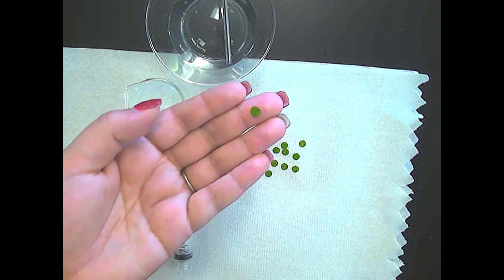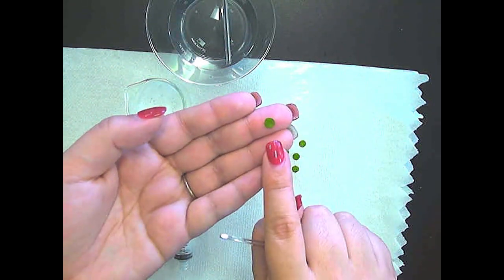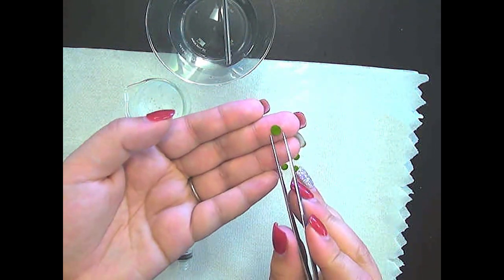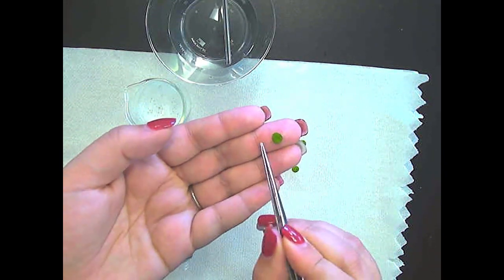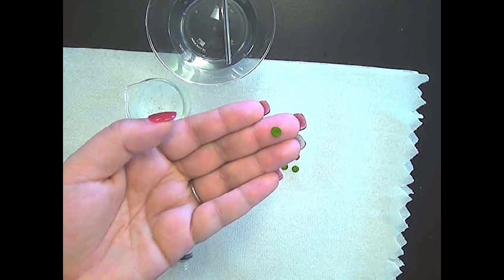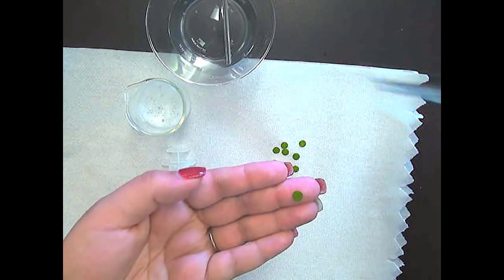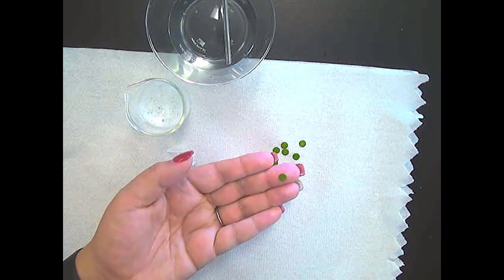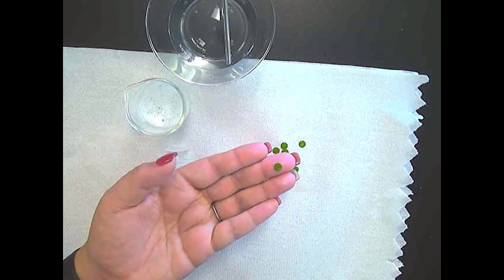Now the chads themselves are just cut from living pothos ivy. Each chad is 0.5 centimeters across in diameter, and the light source we're going to be using is 20 centimeters from our sodium bicarbonate solution, which is going to be the source of CO2.